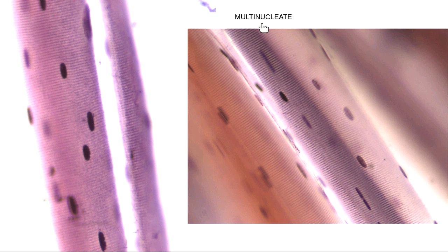So when we look at skeletal muscle tissue, the things that we would see, first thing we see, long and skinny cells. That's the first thing we see. Second thing we see are the striations. And the third thing that we see are these multiple nuclei, these dark spots. That's how we're going to recognize skeletal muscle tissue.